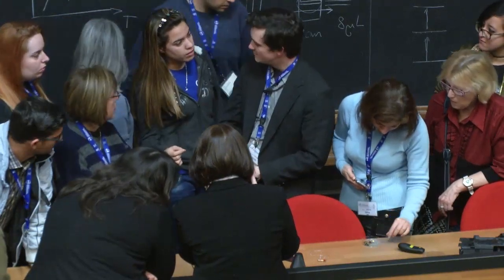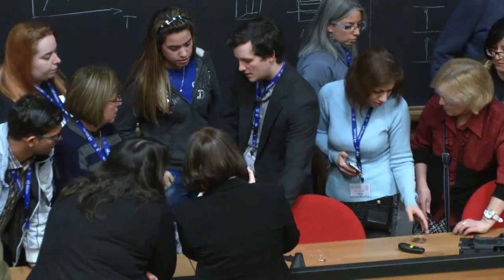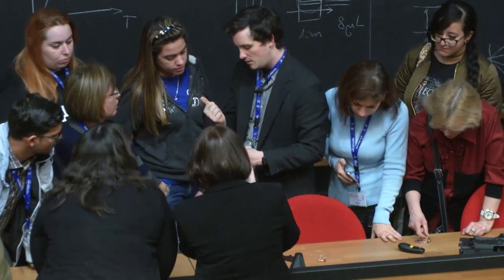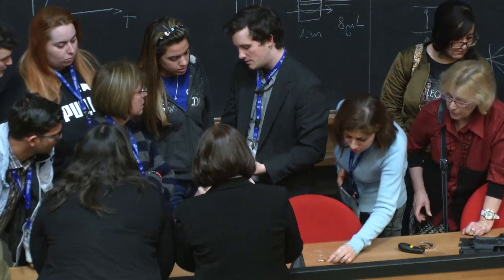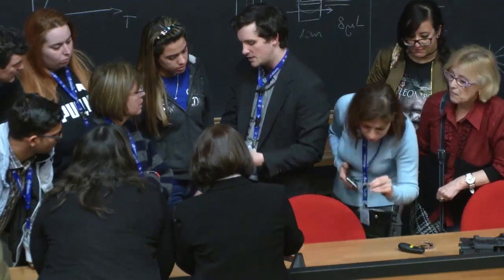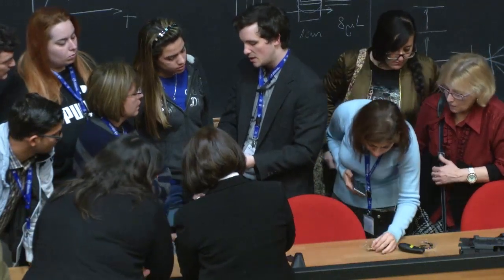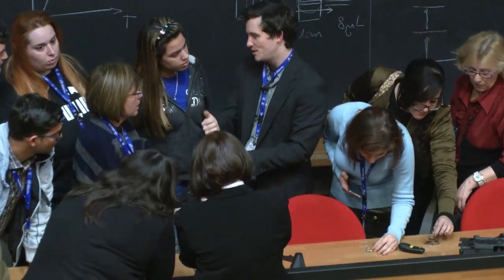Is the sample solid or liquid? The sample in this device? Yes. It's a liquid. It's a water sample, 10 milliliters, and you put it in this cartridge. The contents of this cartridge are absorbent paper, so they're disposable. Once you're done with this test, you would throw these away, and you would have more absorbent pads for the next test. You put the absorbent pads in here, and with a syringe, put the water on here.